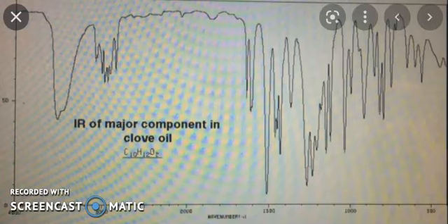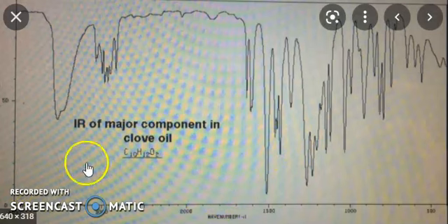You know there are two oxygens and 12 hydrogens and 10 carbons. So this is the structure of IR spectra of eugenol.